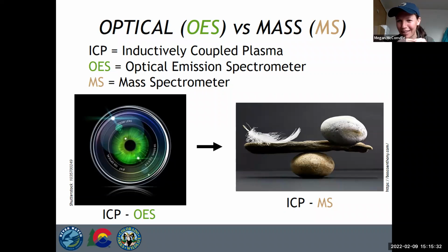I'm not describing it well, right? But if we were to reduce that mass just a little bit, this mass spec could detect those minute differences versus the rock. So maybe we see salt as the rock in a river, these high concentrations, but similarly in the same breath and in that same sample, we want to see really minute concentrations of, say, copper or lead.